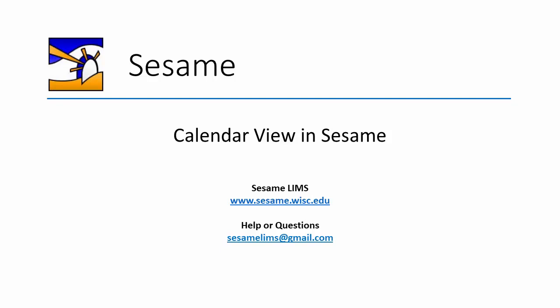Hello and welcome to this video tutorial about creating and working with calendars in Sesame. In this tutorial, we will be working in the Scheherazade module.